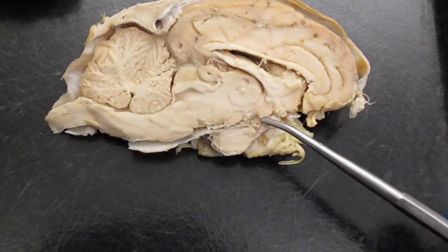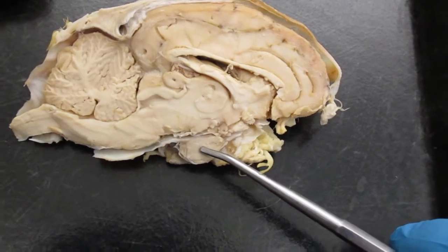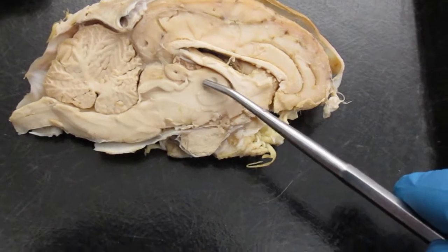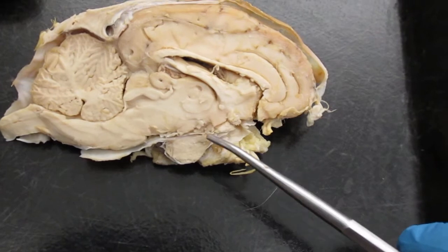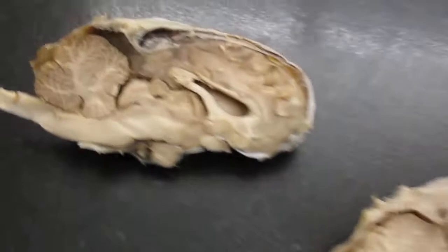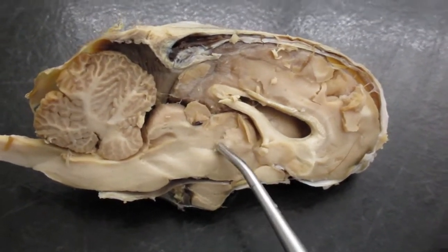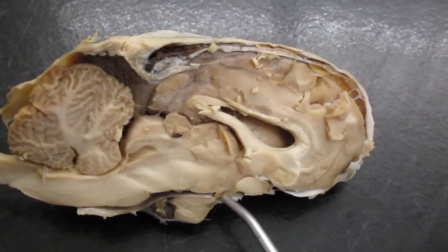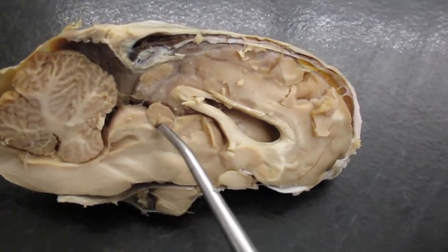So your thalamus, hypothalamus, this is the infundibulum right here. This is the pituitary gland. This is the pineal body. Thalamus, hypothalamus, infundibulum, pituitary gland, pineal body. This sheep brain right here, we can see the thalamus, hypothalamus, the triangle here, infundibulum, right there, pituitary gland, pineal body.